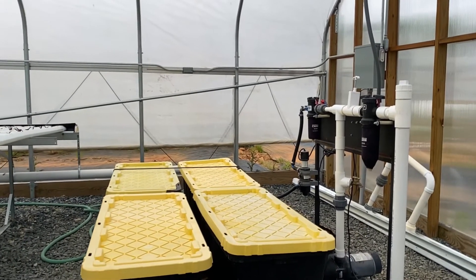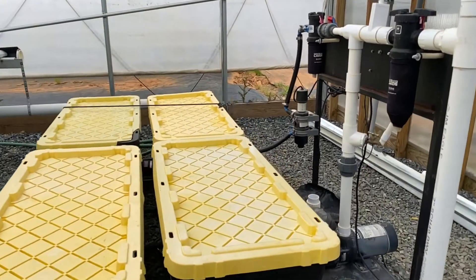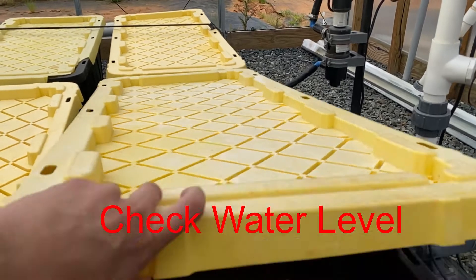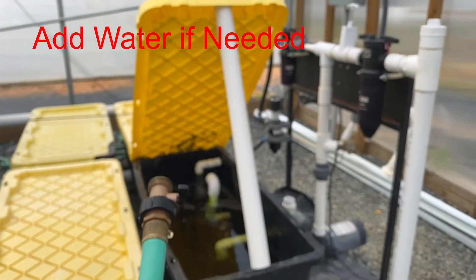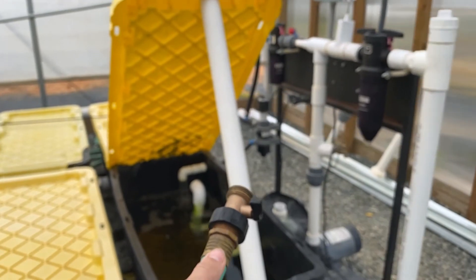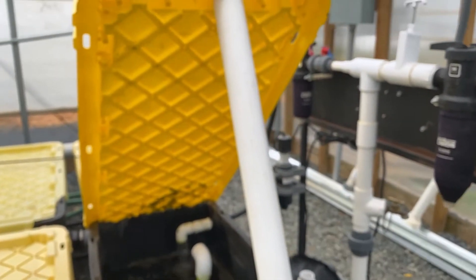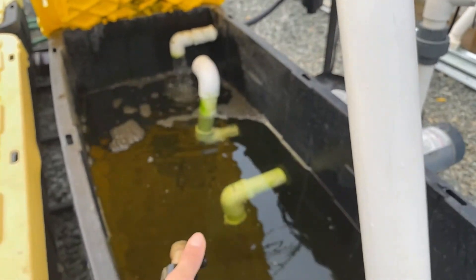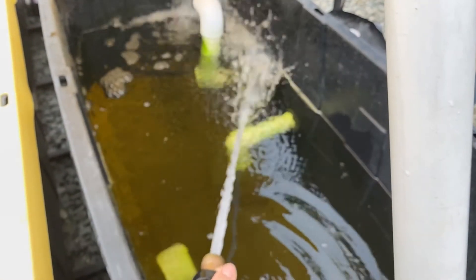The first step to checking the system is ensuring that it has a full tank of water. You will add water to your system if needed. We do this by a hose, but if you're able to, having an off-gas tank or a filtration system attached to your tap water is ideal.